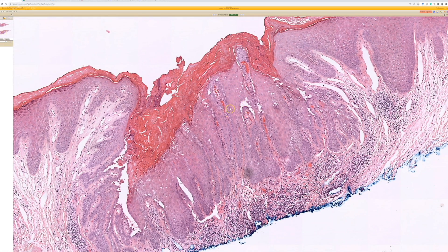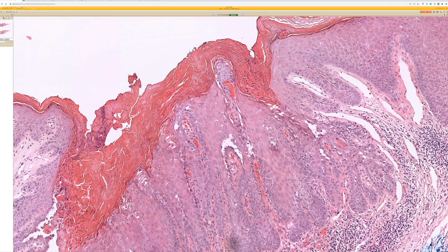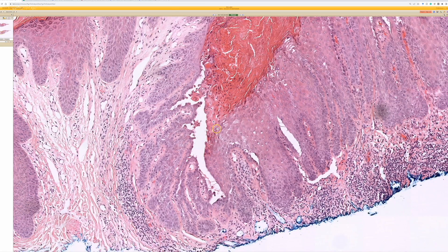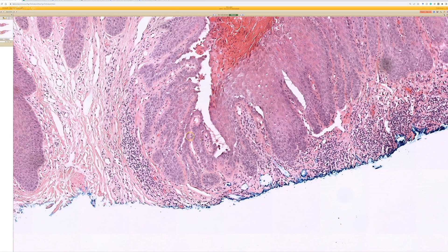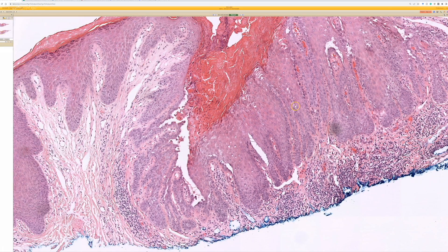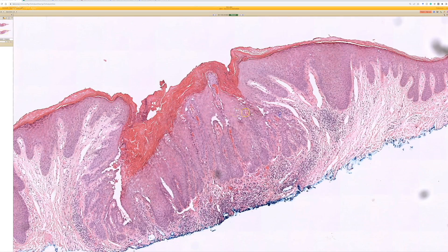It can have a verrucous warty surface in the middle, with this kind of invaginated papilloma or inverted papillomatous look at the edges. These are benign and kind of cool to encounter.